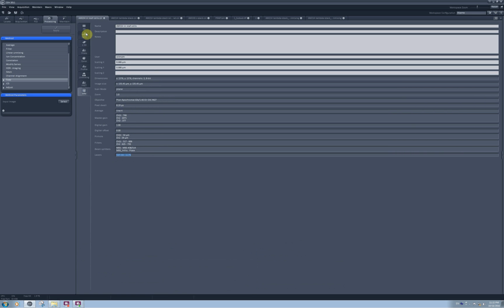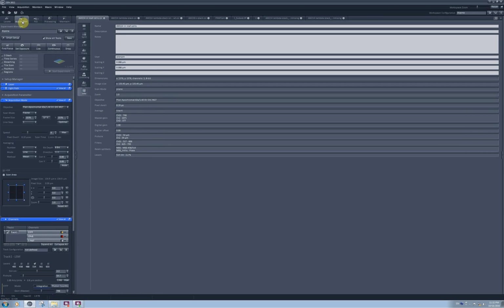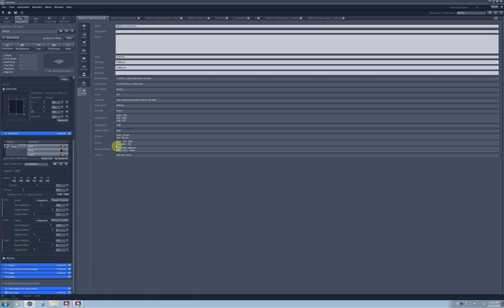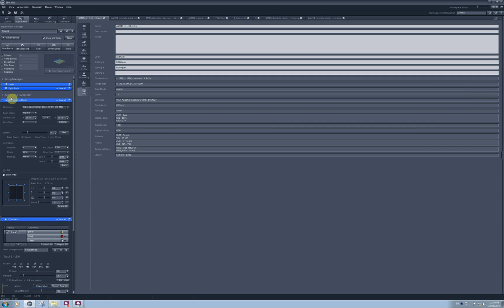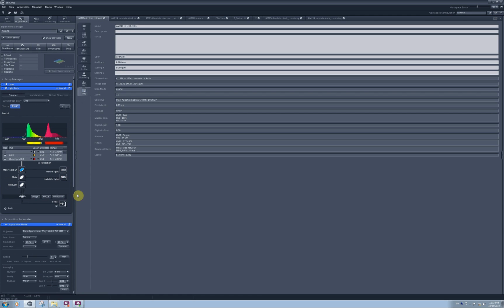The way you can see it would be going to the confocal you used for scanning and clicking on the Reuse button. Then in the Acquisition tab, you should be able to see that I used bidirectional scanning instead of single directional, that the method for averaging was every line, and I was taking the mean from them. It doesn't say here whether I was using single track, but you can see in the light path that it was a single track acquisition.